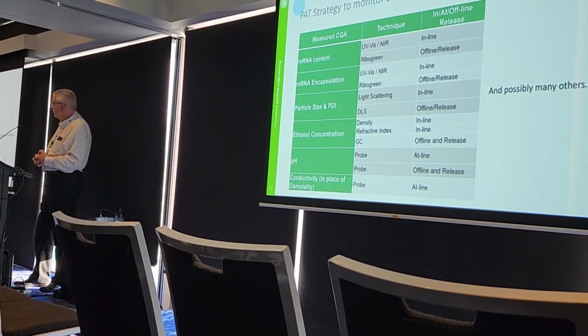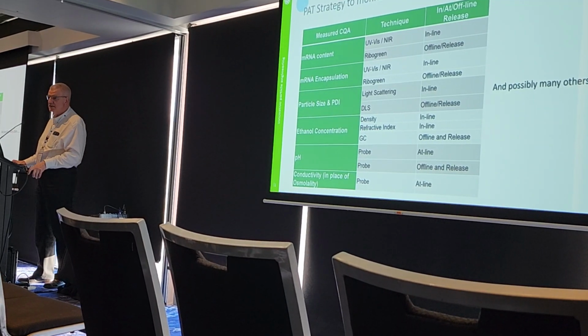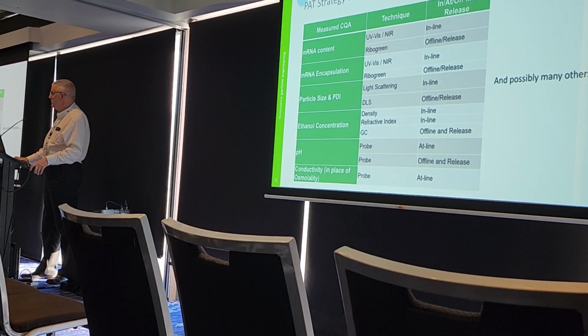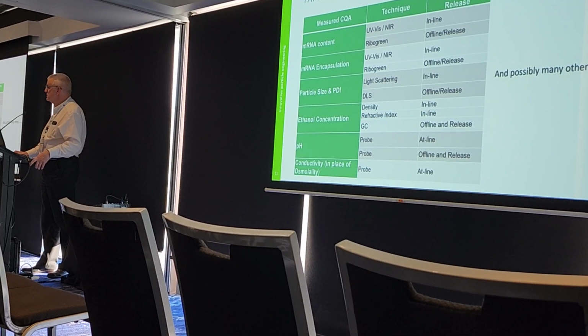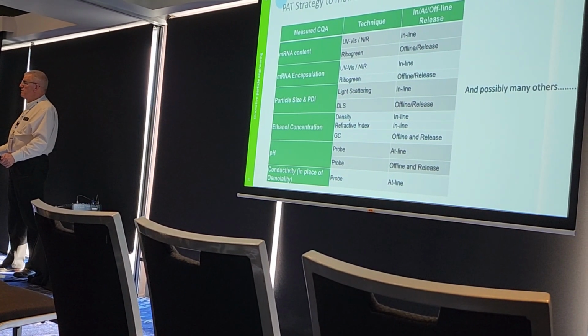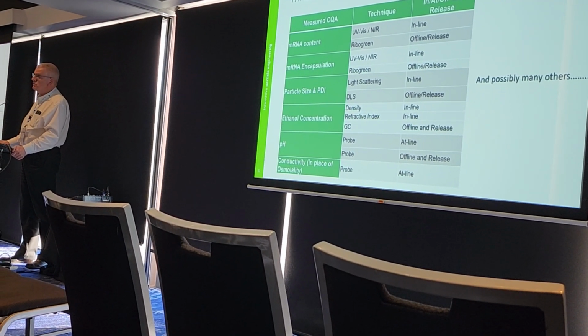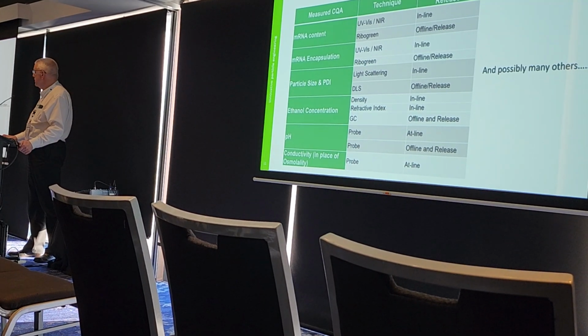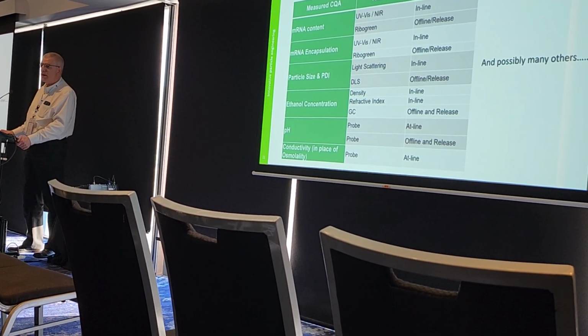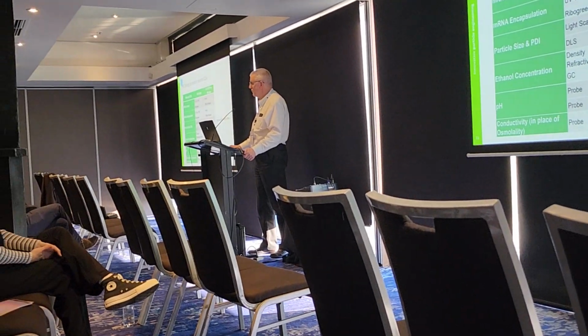So one of the things that we're doing is introducing PAT, process analytical technologies, into our approaches to manufacturing these various different products by having inline or online analytical tools available to be able to give you real-time feedback to give you control.